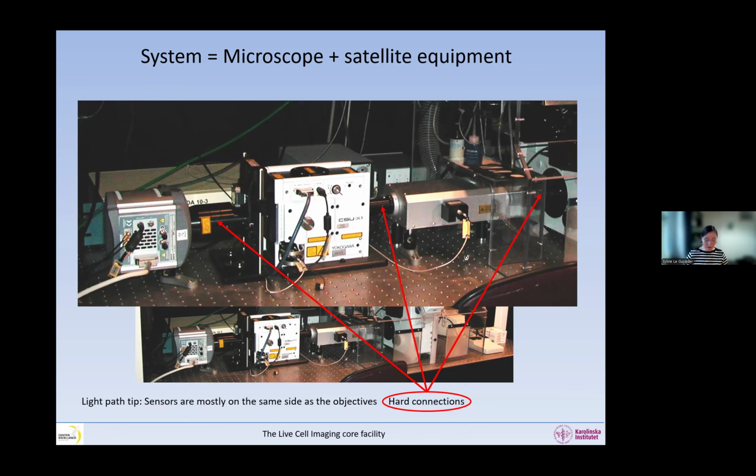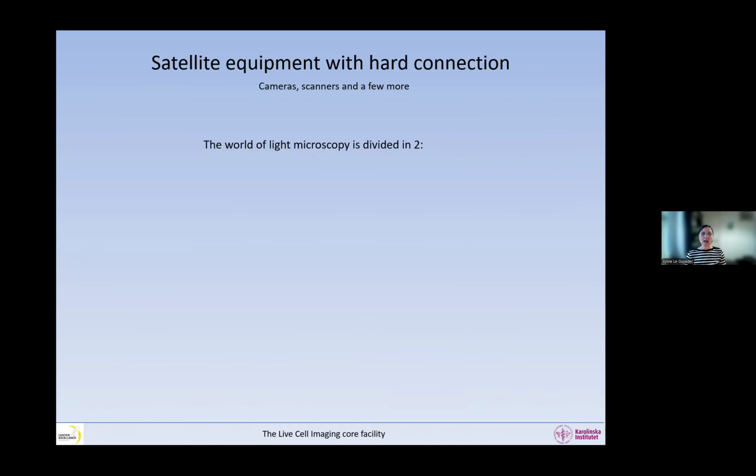Because you took pictures of your microscope, and now you're going to have to tell me what everything is on the pictures. That's one of the assignments. You're going to write on the pictures what is what. So we're going to do all this in the anatomy of a microscope later today, the workshop.